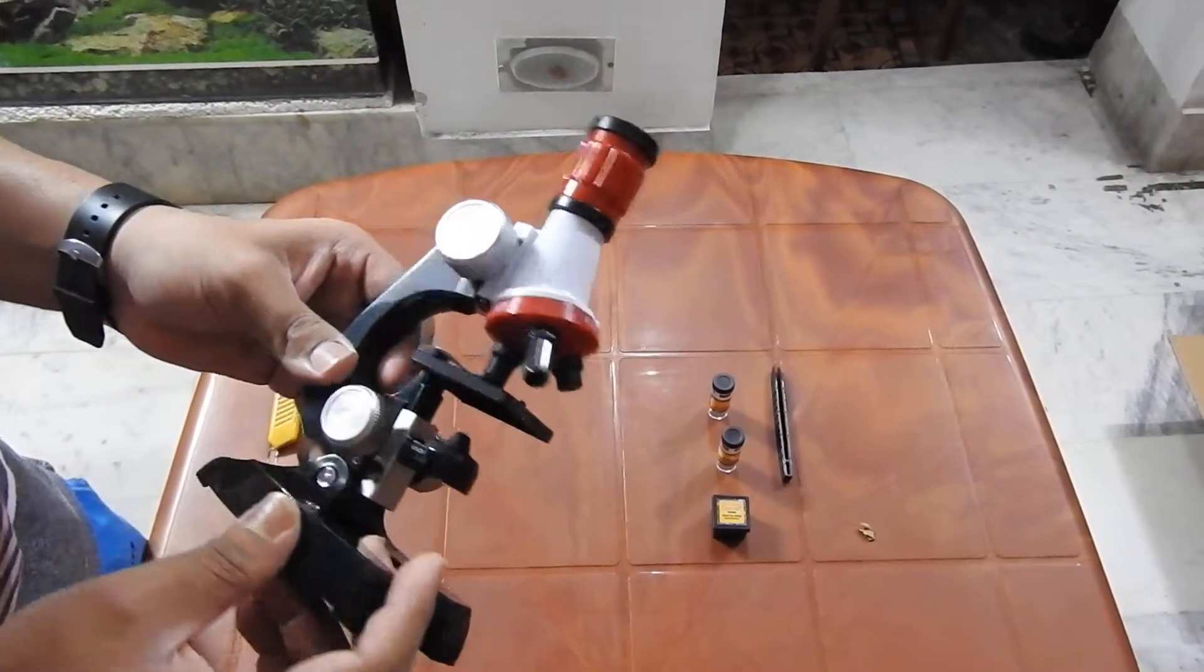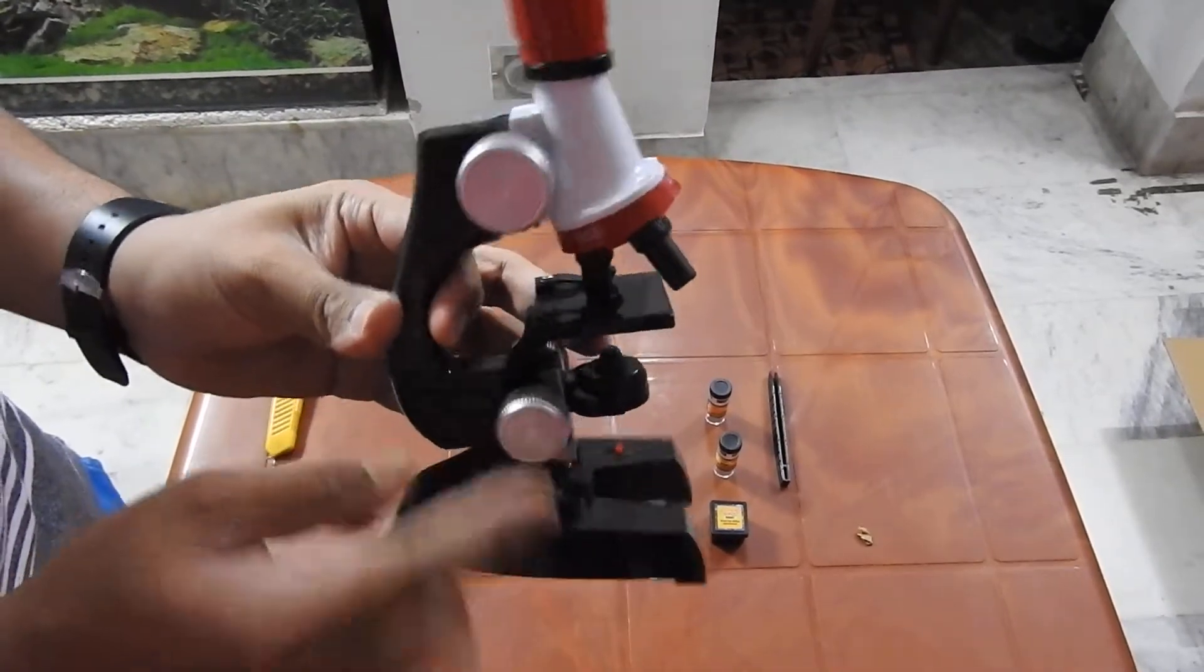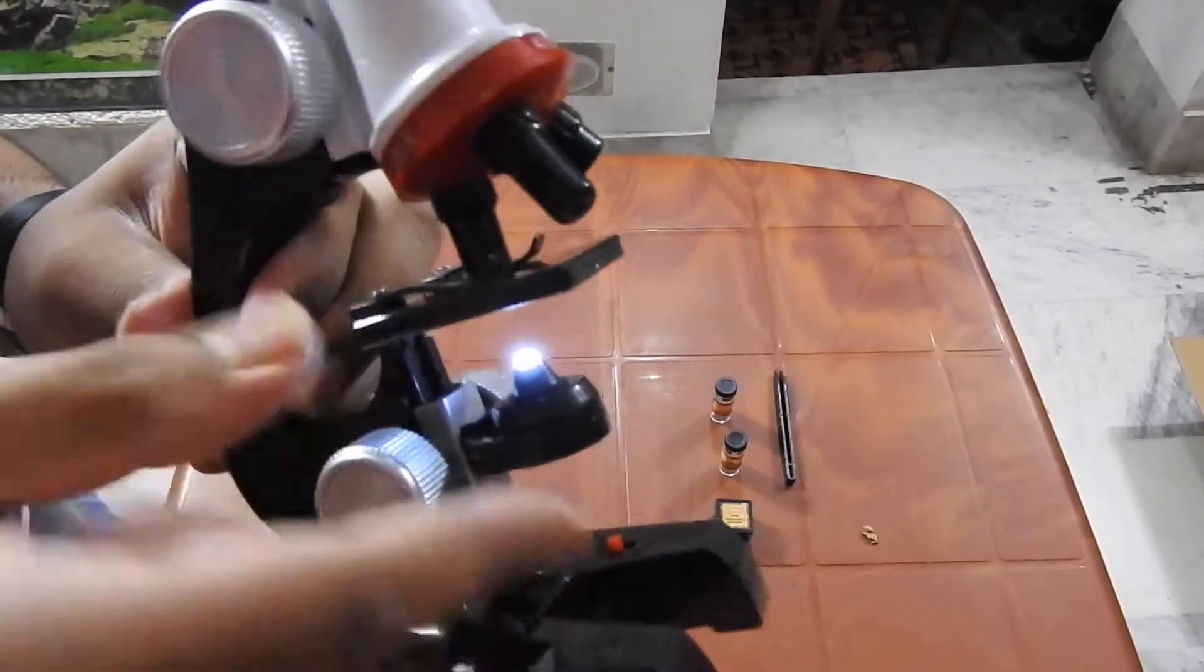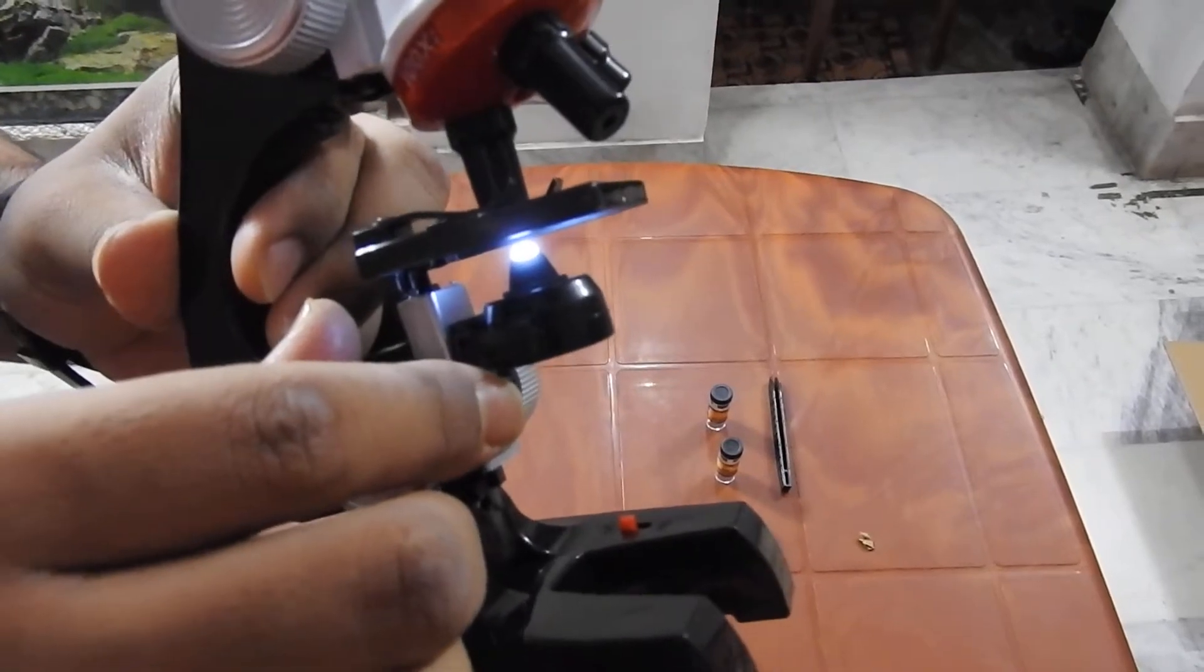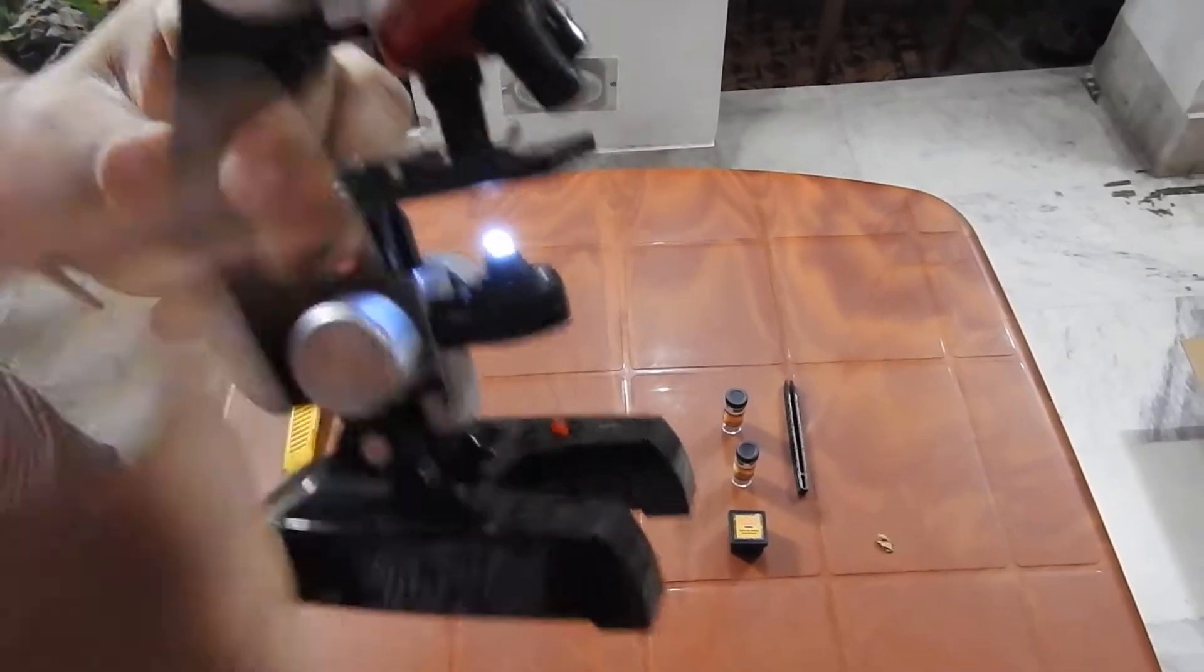Using these coarse adjustment screws you can put the light up and down, I mean upwards and downwards. So as I rotate it in the anti-clockwise direction it goes upward, and as I rotate it in the clockwise direction it goes downwards. So using this you can put the light up and down.